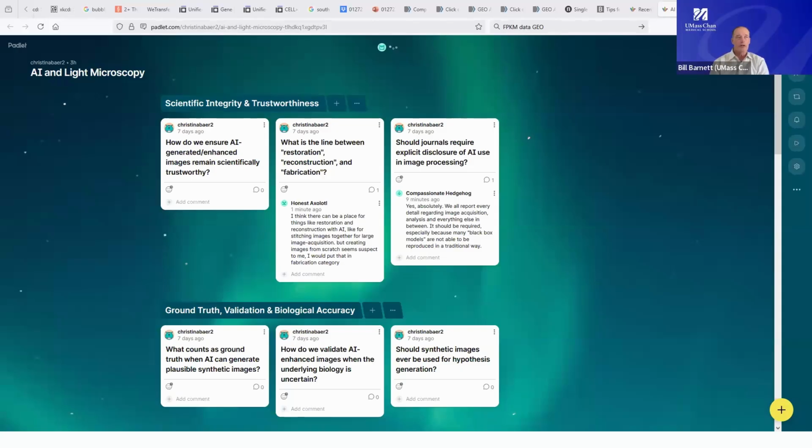I think it might also be interesting to take a look at the other end of the process, where you have a researcher who will at some point want to be able to show the math of their science and say, I can trace my scientific conclusions back to these original documents that were generated as part of my research, i.e. images from a microscope in this case.